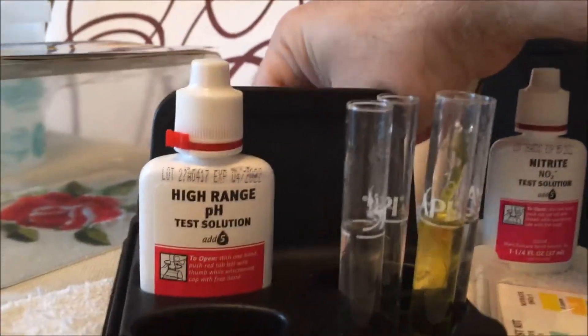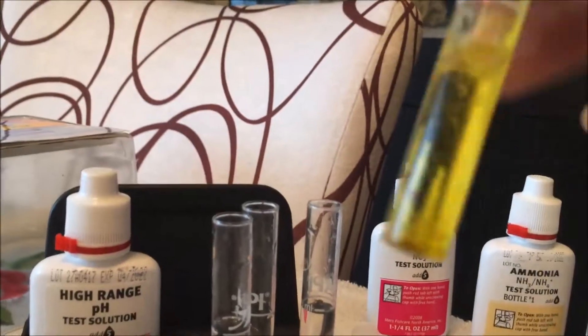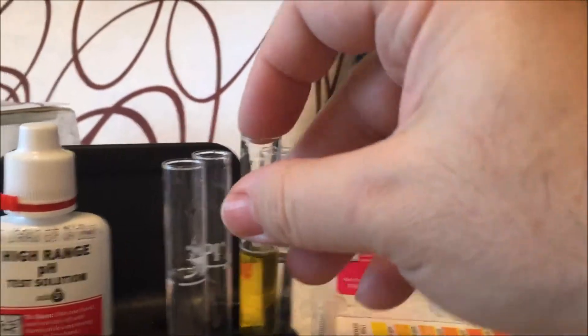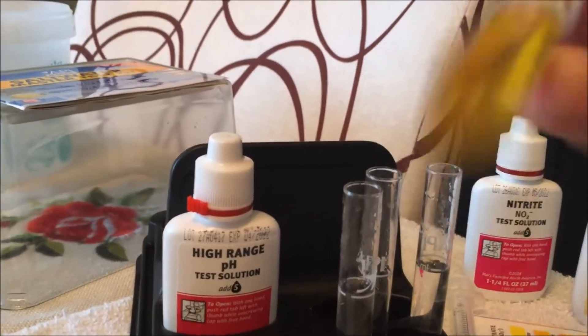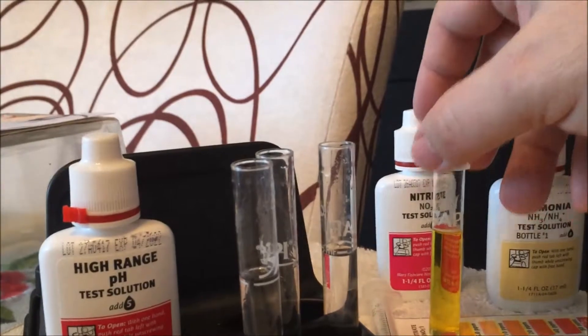We're going to cap it and shake it a few times as per instructions. Now let's go with the second one - 10 drops. Let's go ahead and cap it. So that's your nitrate done.